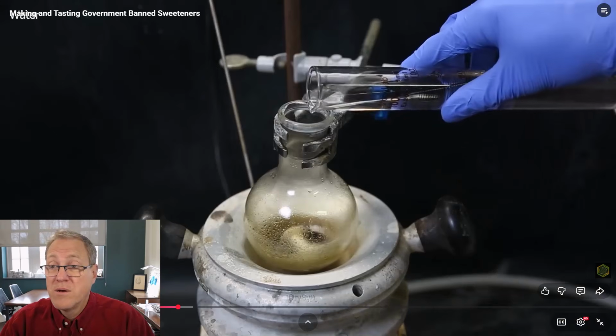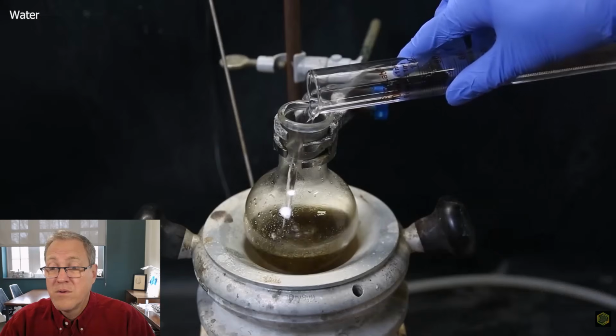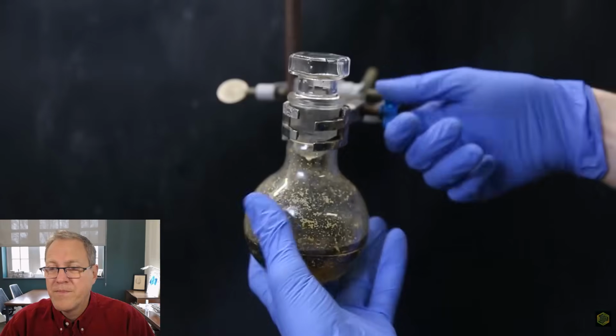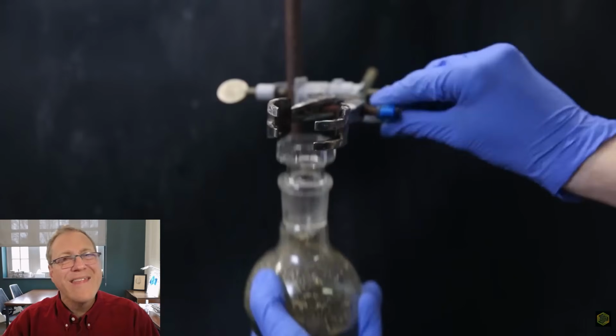To which I add some water, because the product is insoluble in water. I then leave it to stir to get the product to solidify. After a while sitting around, I also added a tiny bit of sodium hydroxide to it, just to help it solidify. And that's interesting. So it's insoluble in water, but he added just a pinch of sodium hydroxide to help it precipitate.